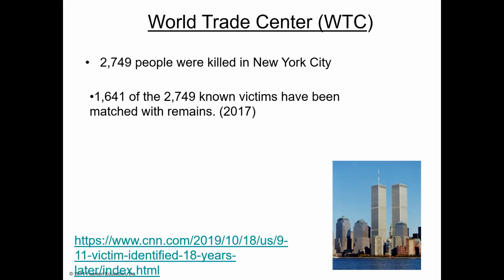They will take DNA that is collected from a victim of the World Trade Center, or even the Pentagon, which was also attacked, and they will do RFLP on 2 different samples and then do gel electrophoresis to compare whether or not that sample belongs to a specific person.